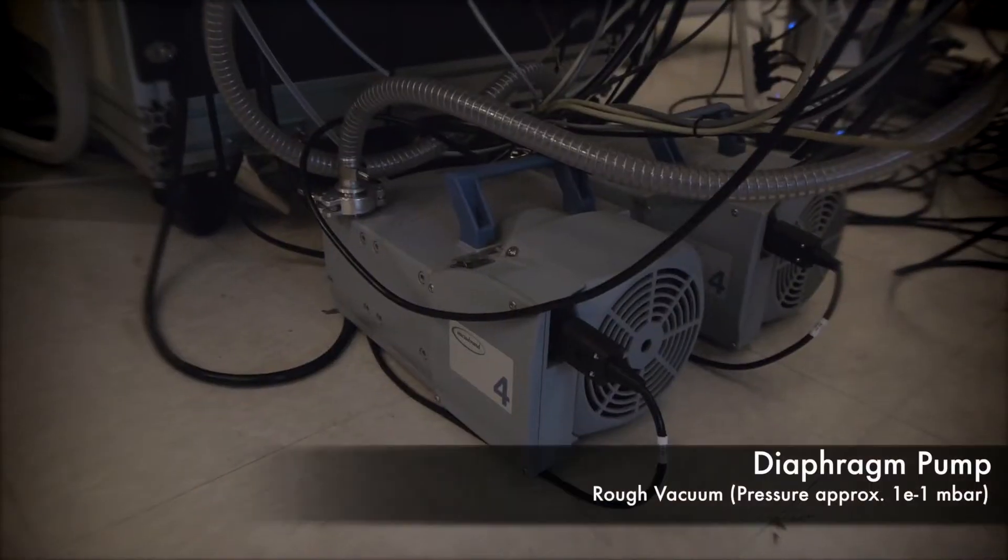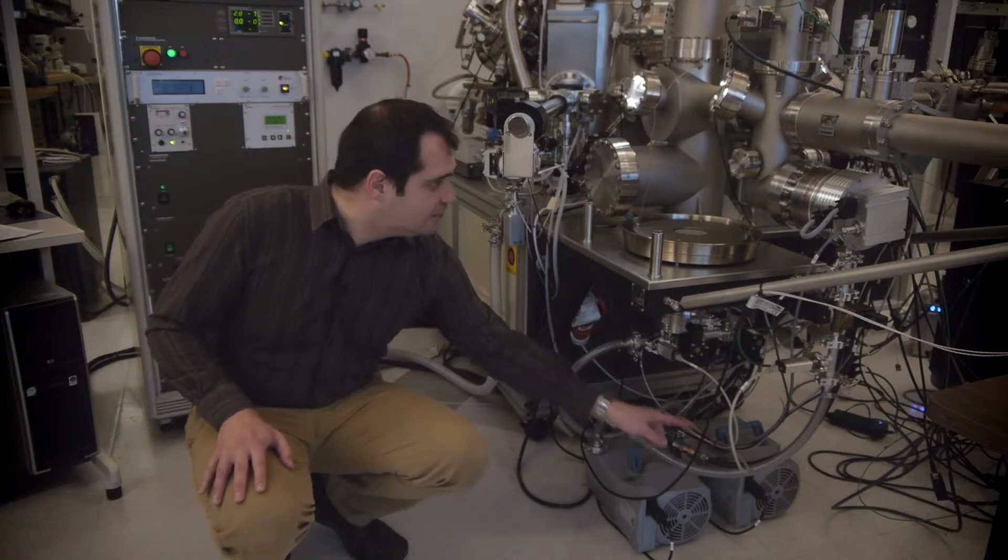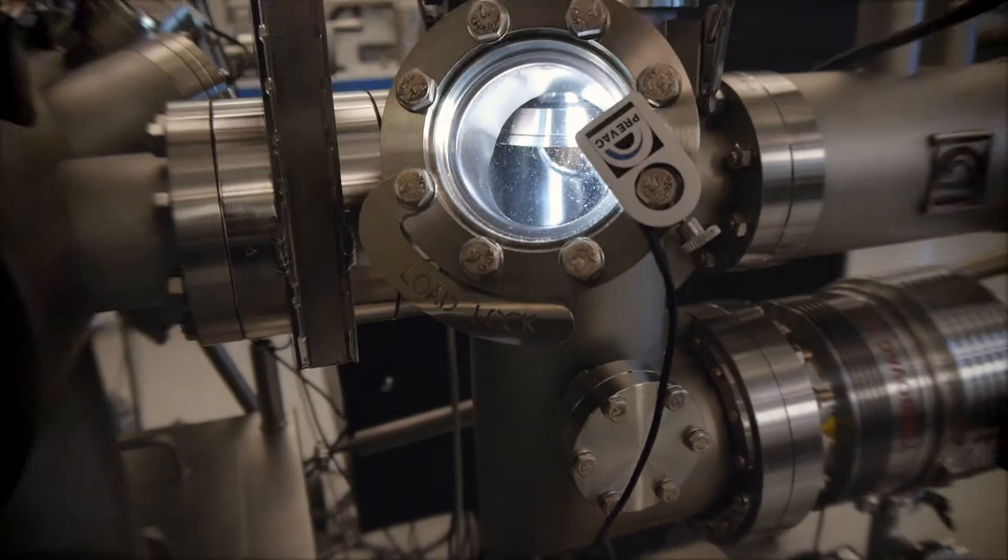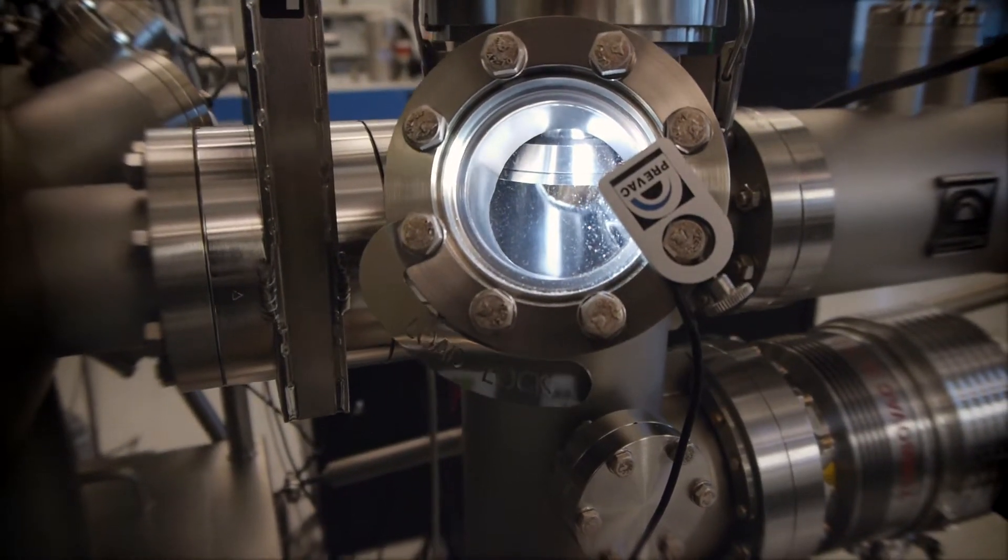Here we use a diaphragm pump. This will pump these lines, pump the whole chamber. So here we have our load lock and it would evacuate this all the way down to a rough vacuum.